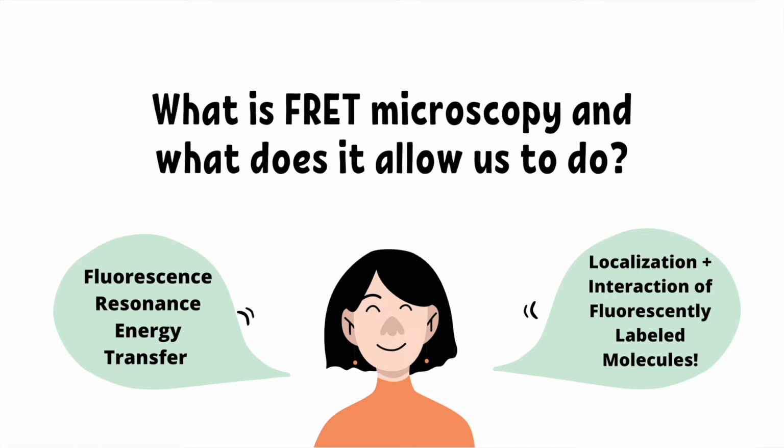So what is FRET microscopy? It stands for fluorescence resonance energy transfer. From the name, you know you're going to utilize fluorescence microscopy. However, the resolution of a fluorescence microscope is several hundred times less than the size of a typical protein. So how are we able to determine if proteins are close to each other?